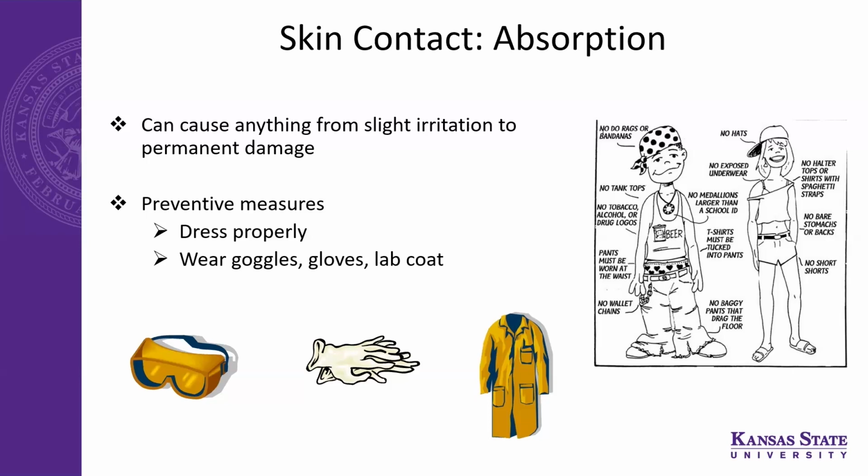Again, there are 3-hour labs, mainly the low-level lab classes. So in case you have to leave, you won't get that extra time back, because once your lab is done, there is another class coming after that. So we make it clear on the very first day when they do the lab check-in, that they'll be sent home if they are not properly dressed.